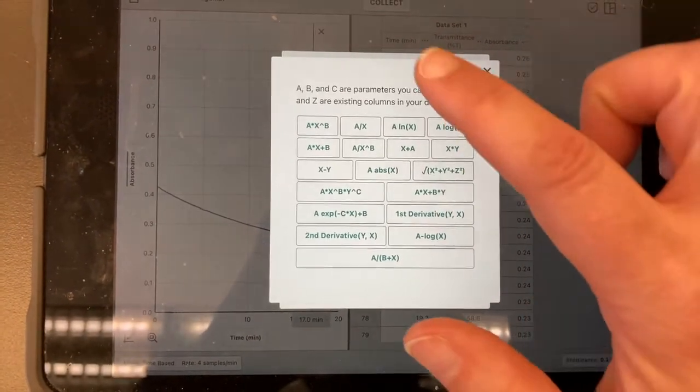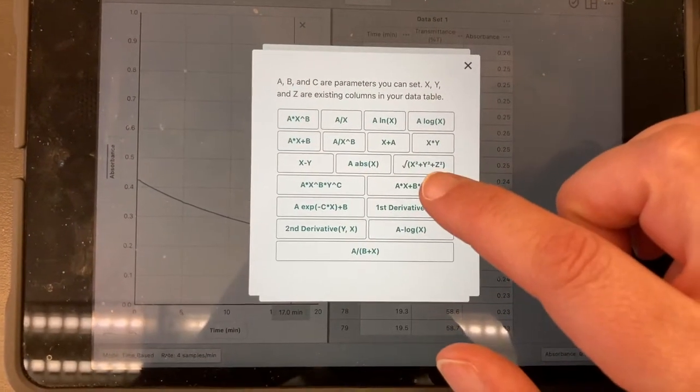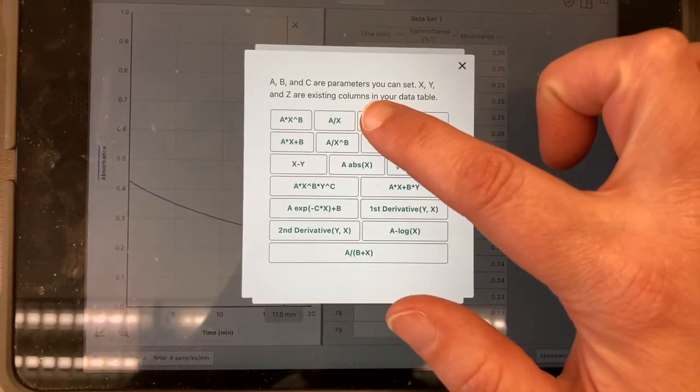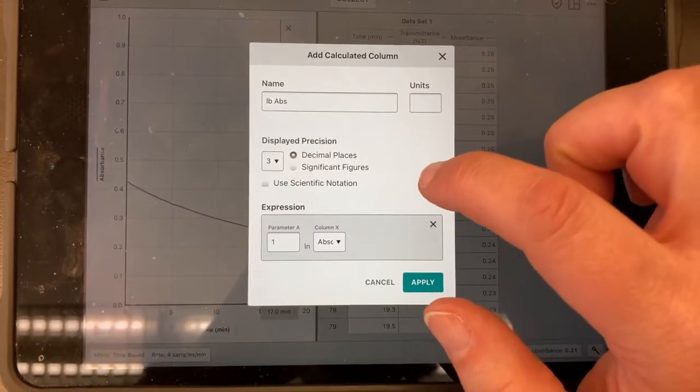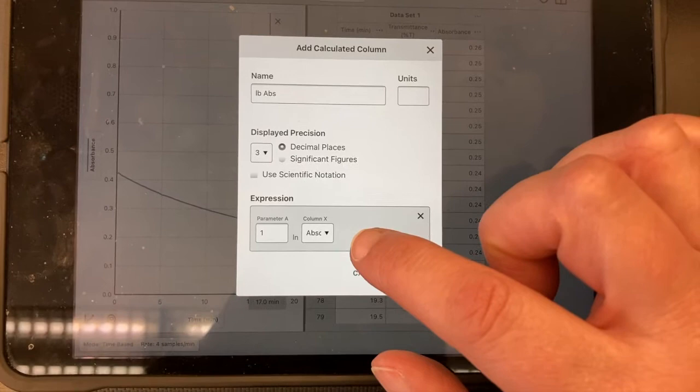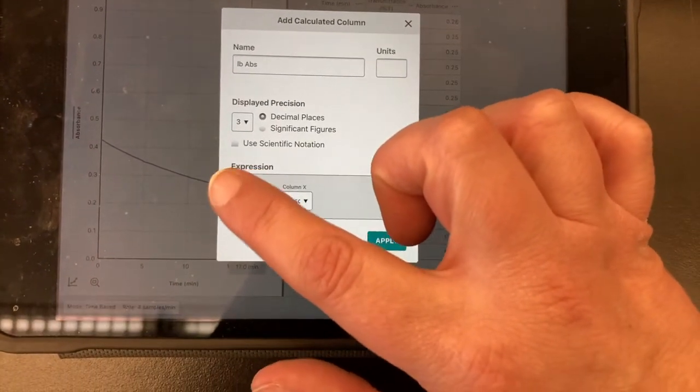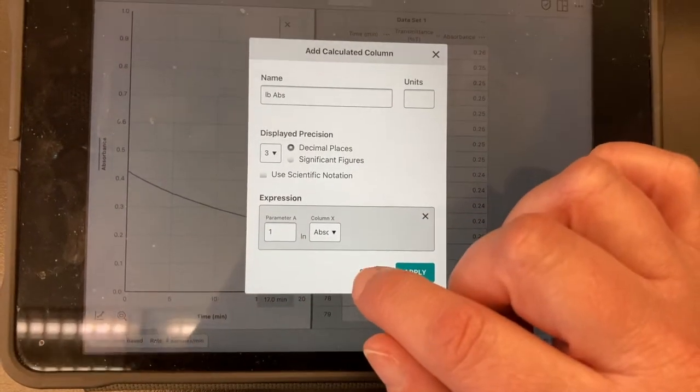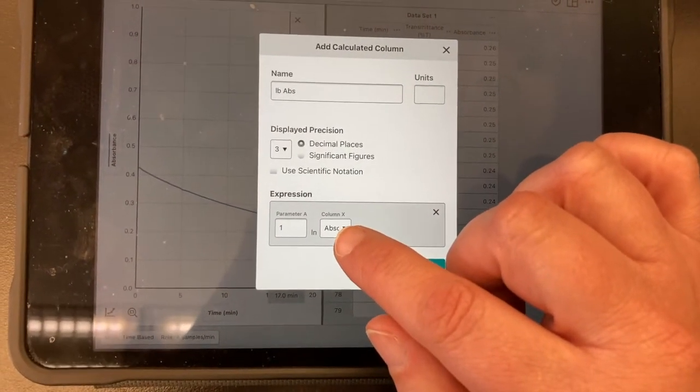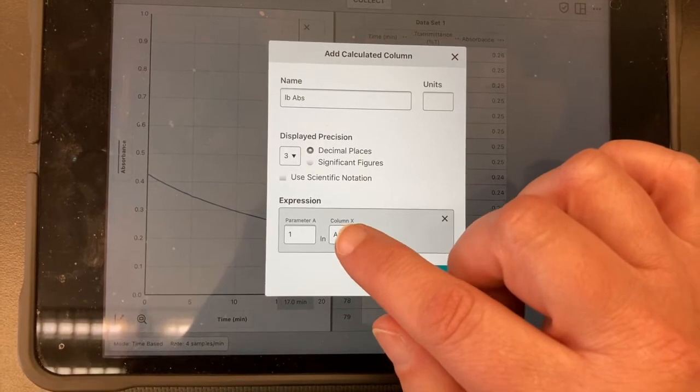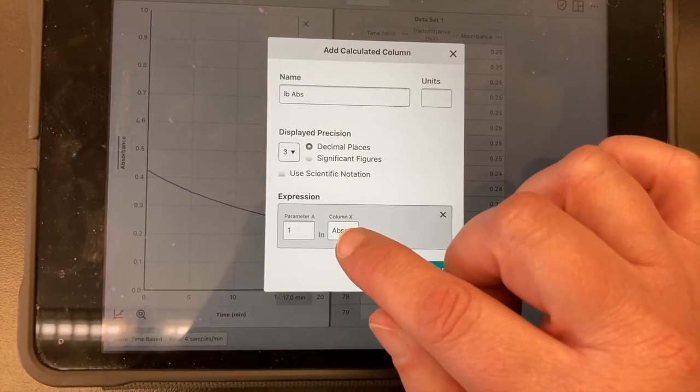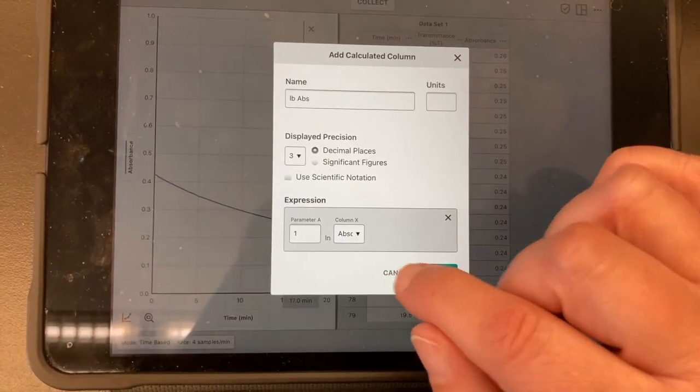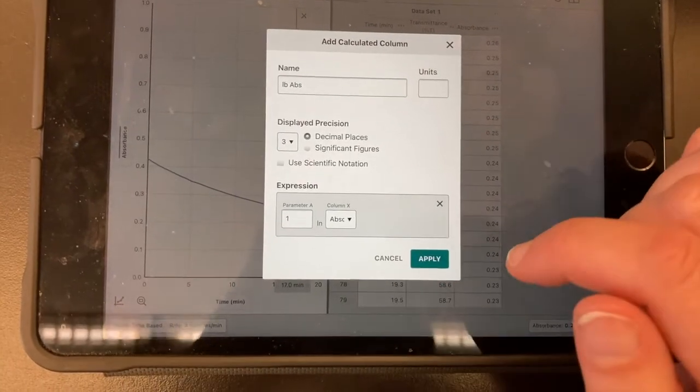And then we are going to insert an expression. So here we are going to look on here until we find the natural log, which is here. And we don't really care what the multiplying factor is, the coefficient is, so we are just going to leave that as one. And then we are also going to do this in reference to the absorbance. So if it says anything other than absorbance under column X, that is what we need to do there. So we are going to apply that.